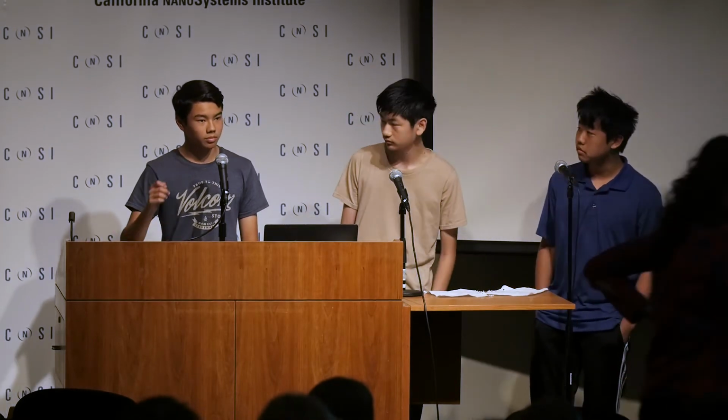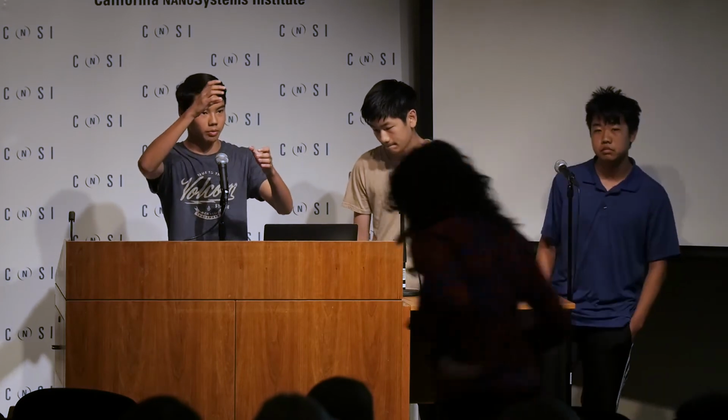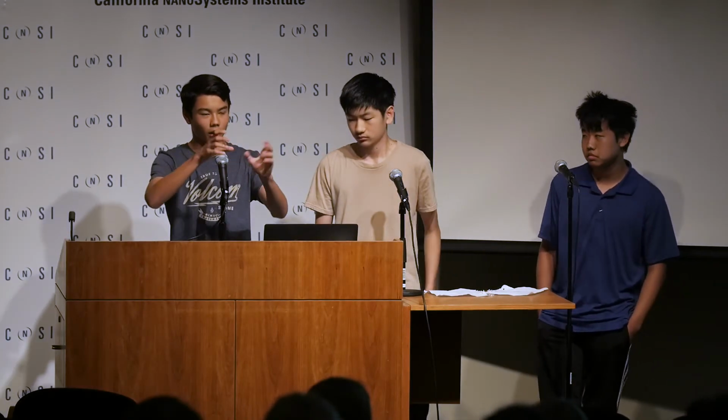Can you explain how you quantified the damage done in each sample? So we had the manometer capped onto the combination of yeast, sugar, and water with a stopper. If the yeast was creating carbon dioxide, the water in the manometer would move.